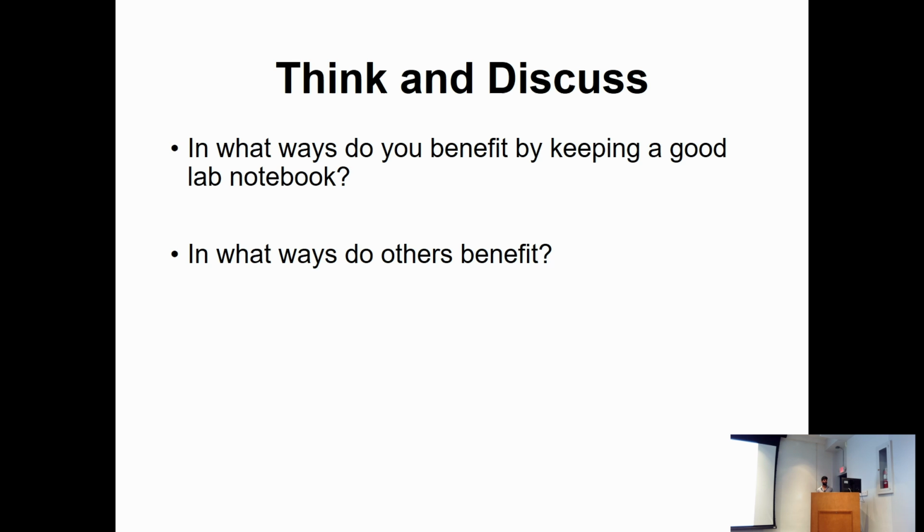So in what ways do others benefit? I know for my group, I work under a grad student, so if I keep a good notebook, she will be able to see what I've done and use it in her final dissertation or research.